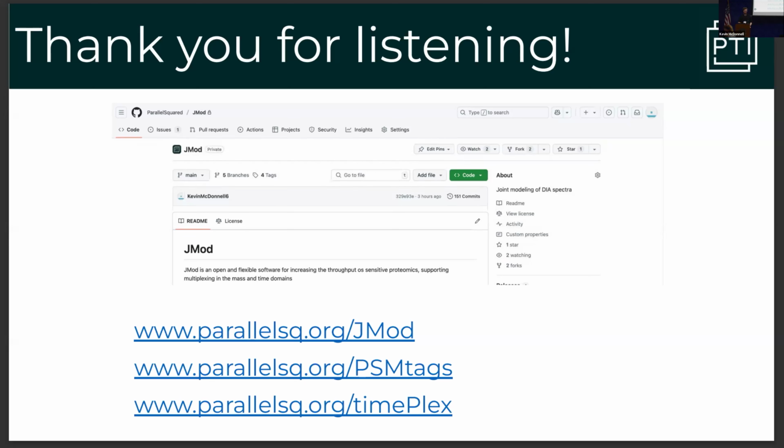Great talk. Also, not a computational question, but if you run 2 or 3 or 5 columns, how significant is the hit on the sensitivity and the quantitation accuracy that you're observing in your data analysis? So you're using one mass spectrometer, you're using a trap, there are competing ions and so on. What do you see? The effect of multiple columns? Oh, okay, you mean artificially increasing the complexity of the sample.